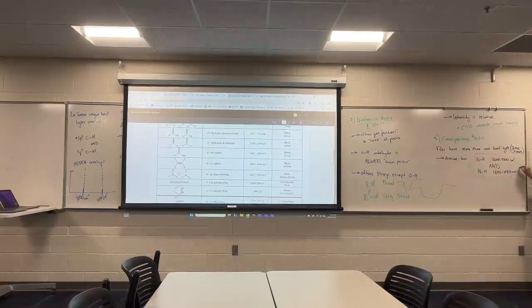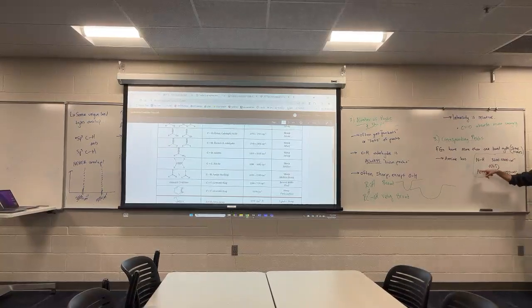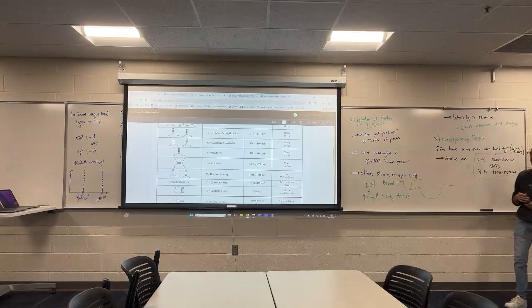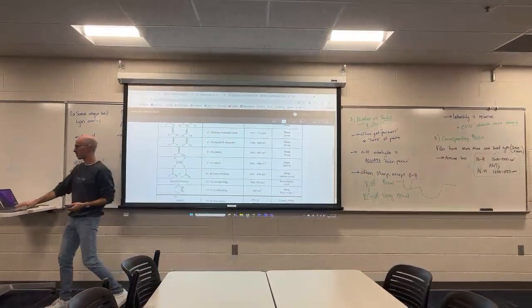These two peaks correspond to the amine. If I see one of them and I want to correlate it to that bond type, I must also correlate the other. Yeah? Let's look at another one. And again, we'll start at the high end range here.